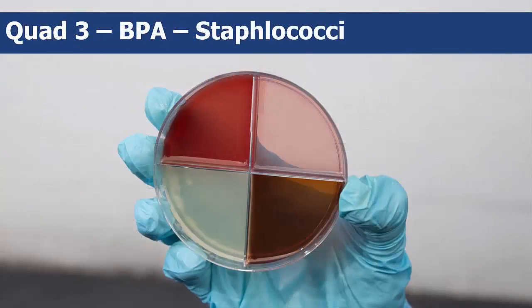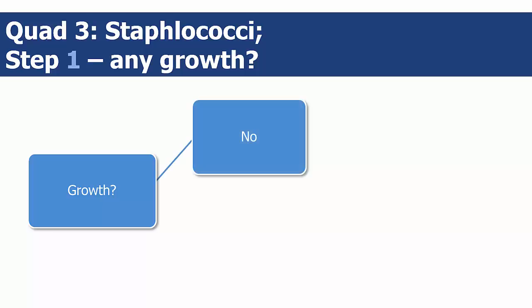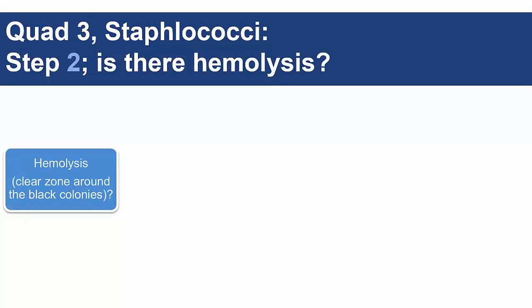The third quadrant on the quad plates will indicate growth if the bacteria are staphylococcal. Step 1 is to determine if there is any bacterial growth. If there is no bacterial growth, you do not have any staphylococci bacteria and you need to check your other quads. If there is growth in this quadrant, proceed to step 2, which is to determine whether the colonies are black with no clear zone or hemolysis, or black with a clear zone of hemolysis.